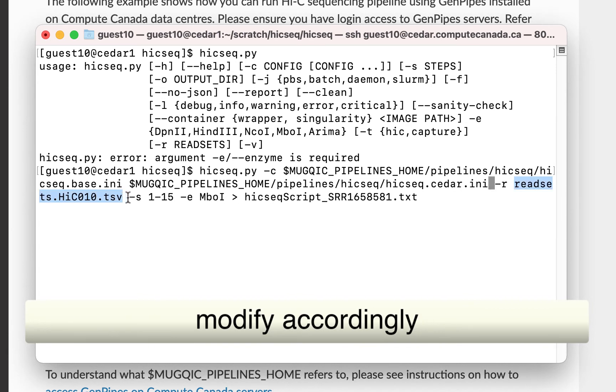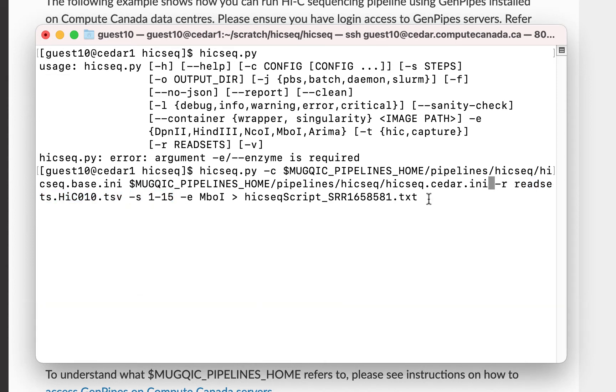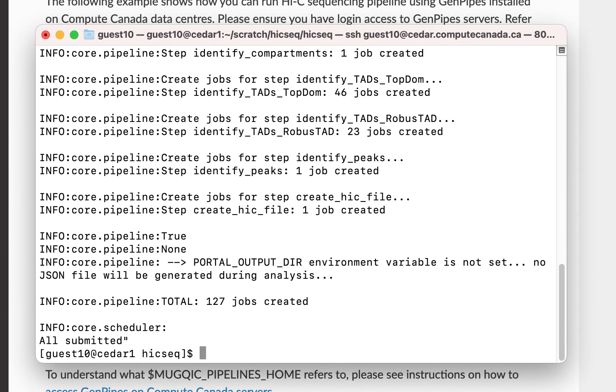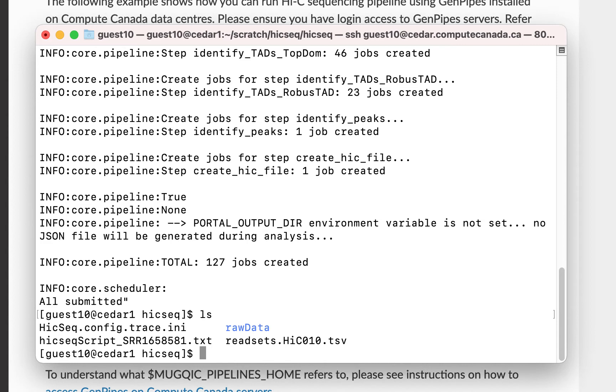Paste it here and change the .ini file for your corresponding cluster. Here, you must correctly specify the readset file name and the number of steps you would like to run. Press Enter after you modify the code. GenPipes now creates a script with all the jobs to submit to the Compute Canada cluster.